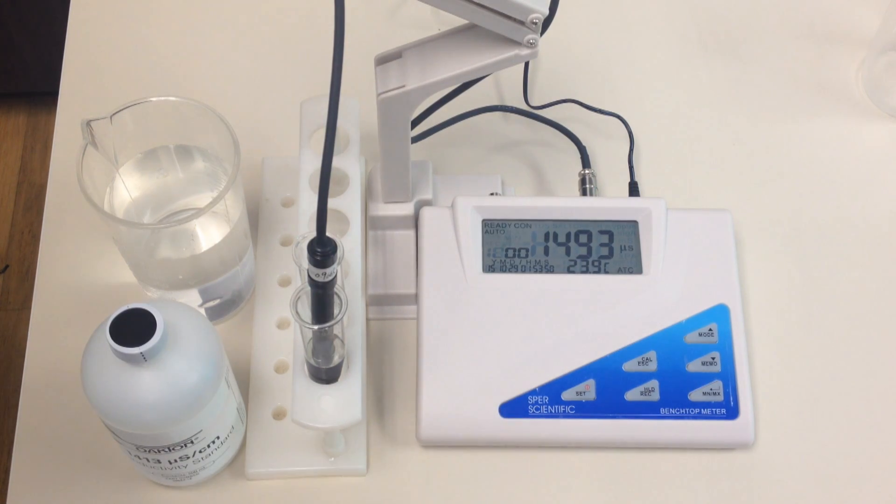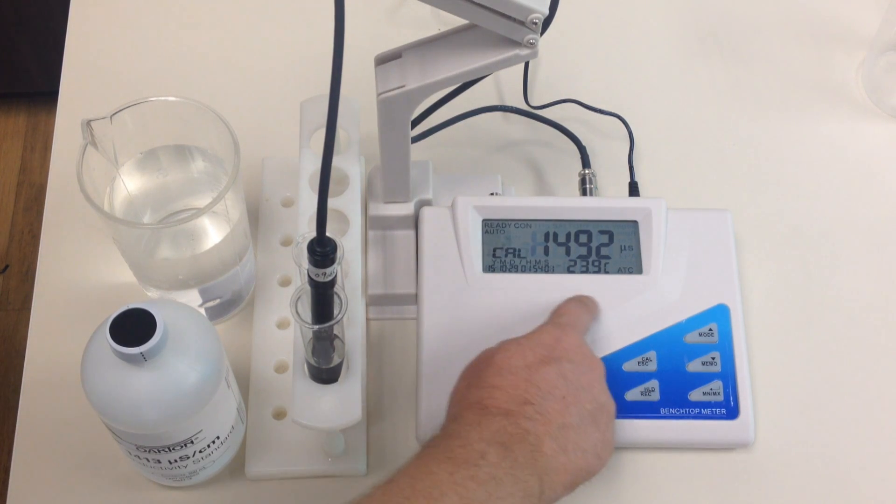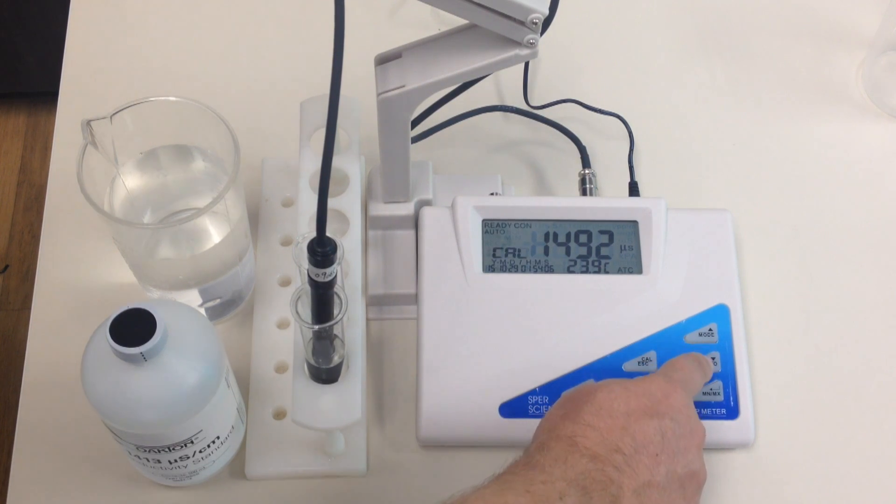Now, once we know that we're in the right mode, we're going to start calibrating the unit. And again, because it's an auto calibration, it's very simple to do. All you do is hit the calibration button. We're now going to be calibrating the unit, wait for it to stabilize.